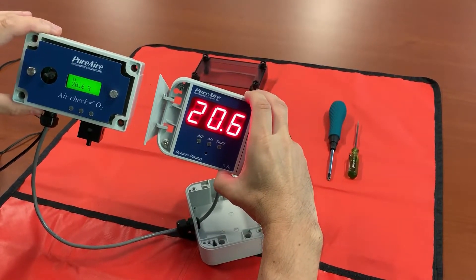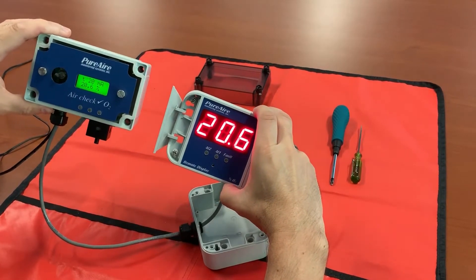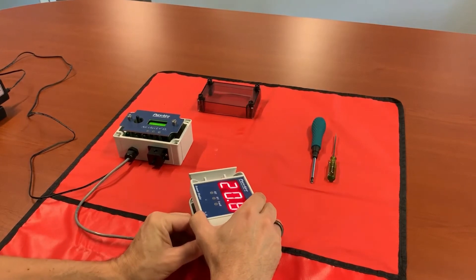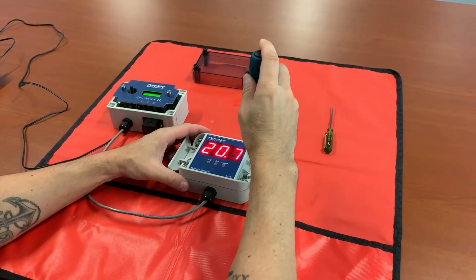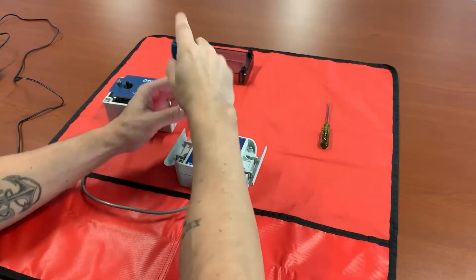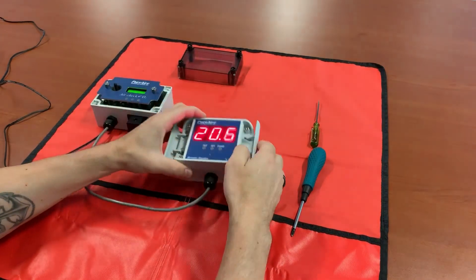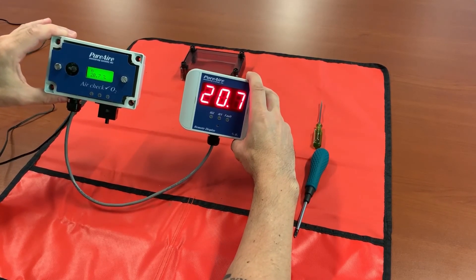And 20.6 on your remote display. At this point you have now synchronized your monitor and your display — everything is set. All you have to do is button everything back up, pop your little tabs into place, tighten the captive screws, and make sure you tighten all of your cord grips so that nobody walks by and pulls your wires out of your terminals. Close it up and there you go — we've now connected our remote display and our monitor.